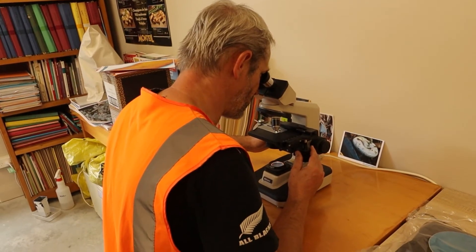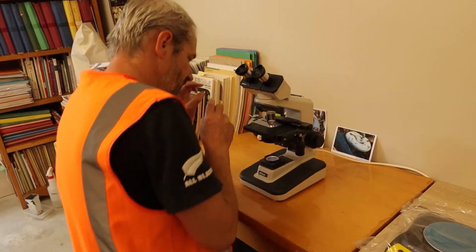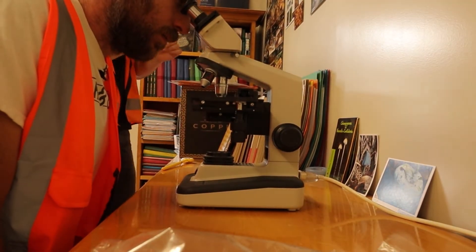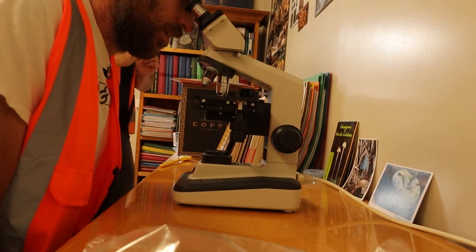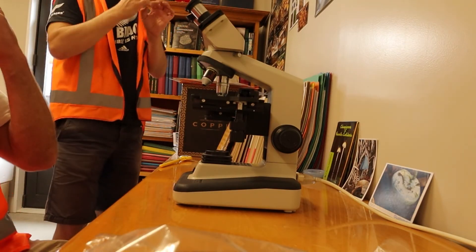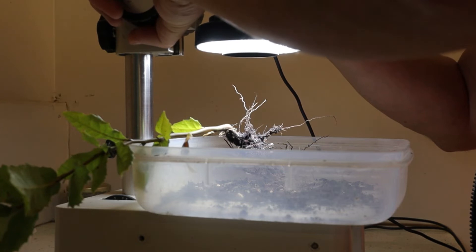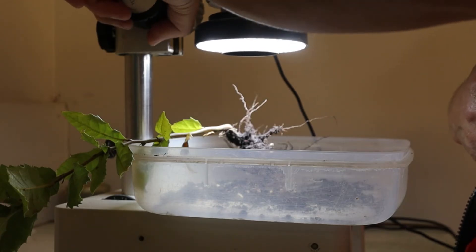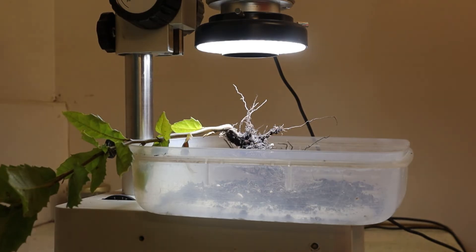The one that's a bit more rust colored is just an older root — there are tannin deposits. You can see three longer cells at the center; I think they are young root hairs, cells that are starting to go off the roots. If you were looking at a hypha under the microscope it would be 50 times smaller — really, really thin. You can look at all the roots and they are just not swollen enough, so I'm very confident there's nothing there.